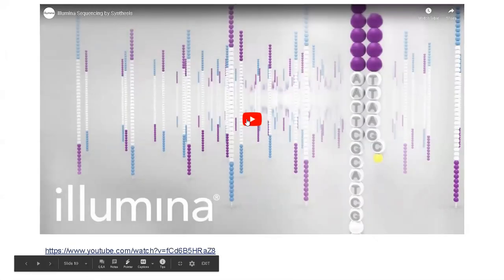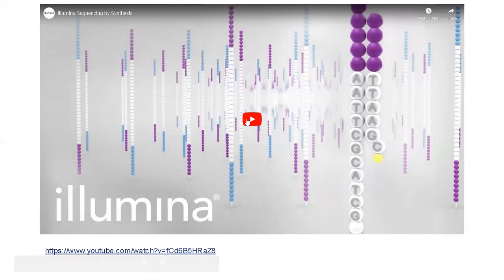Hey, Mohak? Yeah. I have a question. When they chop up the sample, they use some generic endonuclease that cuts all over the genome. Mostly they use sonication, and then they do a size selection based on whatever fragments you get. Okay. But to get the adapter molecule to ligate to the fragment, post sonication, how does it generate sticky ends? You need some sticky end on the fragment, like an overhanging bit.